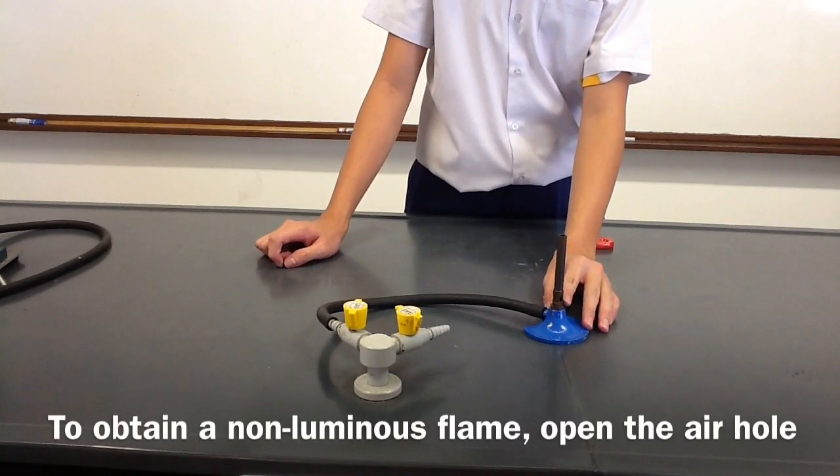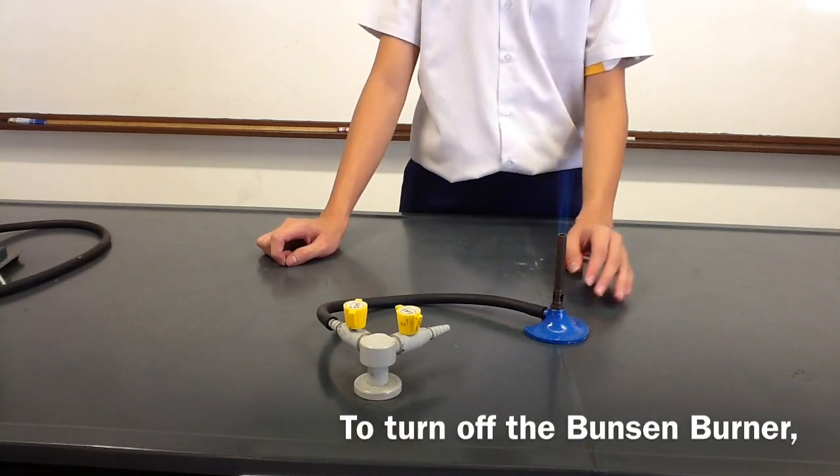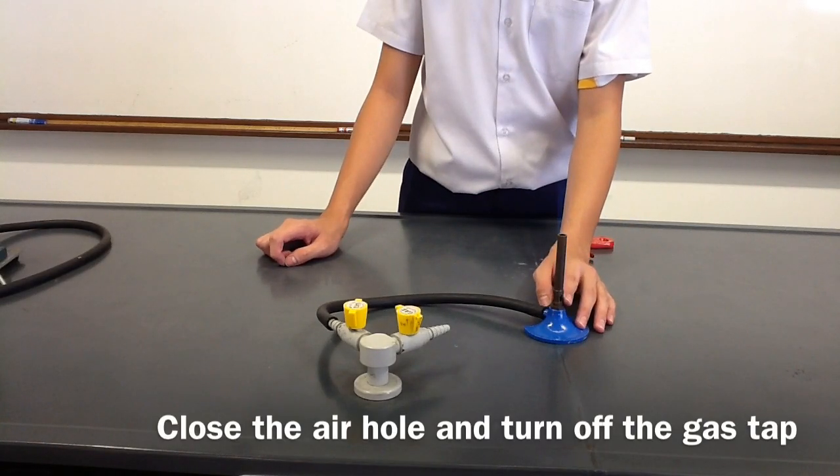To obtain a non-luminous flame, open the air hole. To turn off the Bunsen burner, close the air hole and turn off the gas tab.